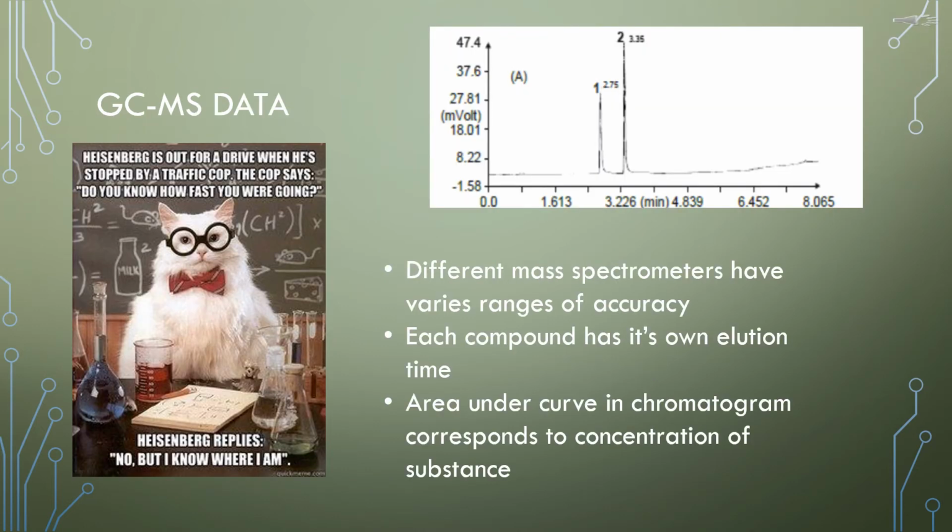To first interpret the GCMS data, one must understand that the x-axis on the chromatogram is the retention time, which demonstrates the amount of time it takes for the analytes to pass through the column and reach the mass spectrometer detector. The peaks along this axis correspond to the time at which each of the components reach the detector. The type of column during the analysis, along with other factors such as flow rate, injection temperature, and oven temperature, can influence the retention time. To conserve consistency, it is recommended to maintain the same parameters to maximize accurate readings.